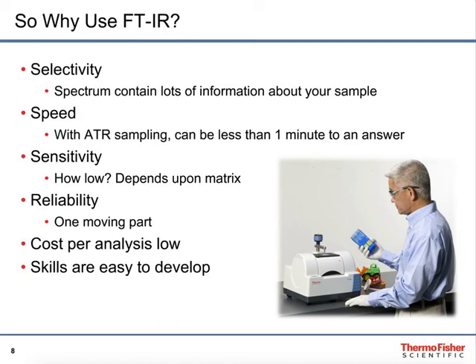The reliability, these instruments can be running for many, many years. There's only one moving part, and that's the interferometer mirror. The cost per analysis can be quite low because the initial investment and the long-term operating costs are not that high. And the skills are very easy to develop. To operate this in a QA/QC lab can be taught in less than an hour. More complex analyses obviously would require longer learning curves, but nevertheless, the basic skills to operate this are very easy to learn.